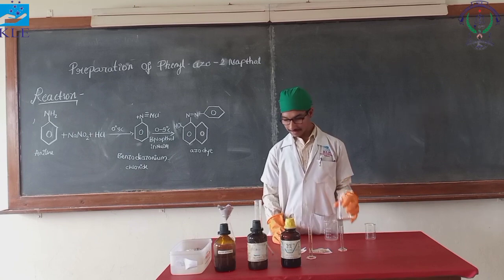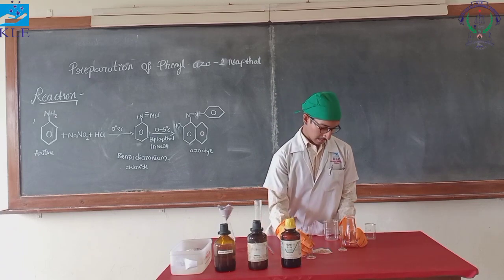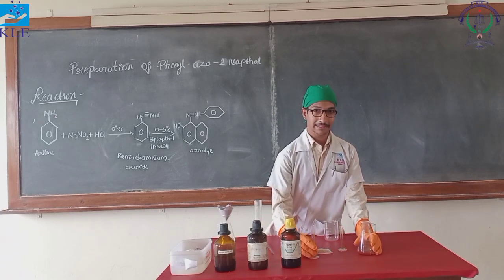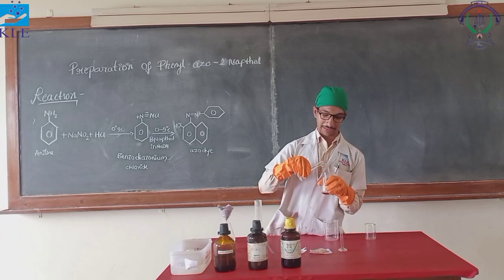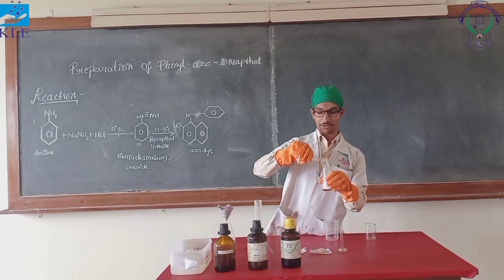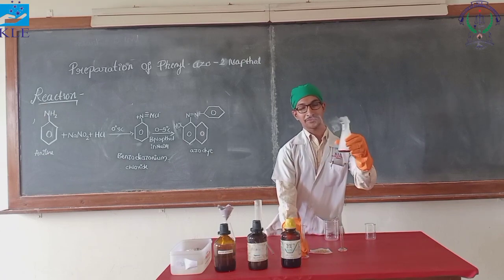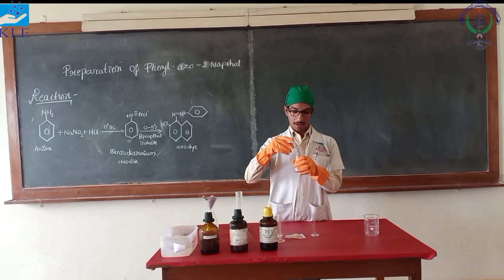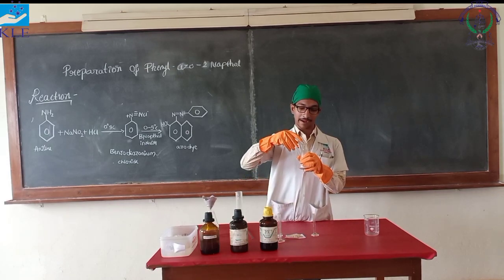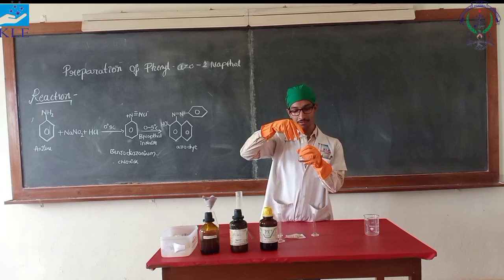Coming to the procedure. Take 4 ml of aniline in a conical flask. To this add 10 ml of concentrated HCl. As aniline is carcinogenic, we have to use personal protective equipment like gloves, respiratory mask, and goggles while handling aniline. After adding concentrated HCl, we can see white fumes are coming. To this add 20 ml of distilled water to make the solution homogeneous.